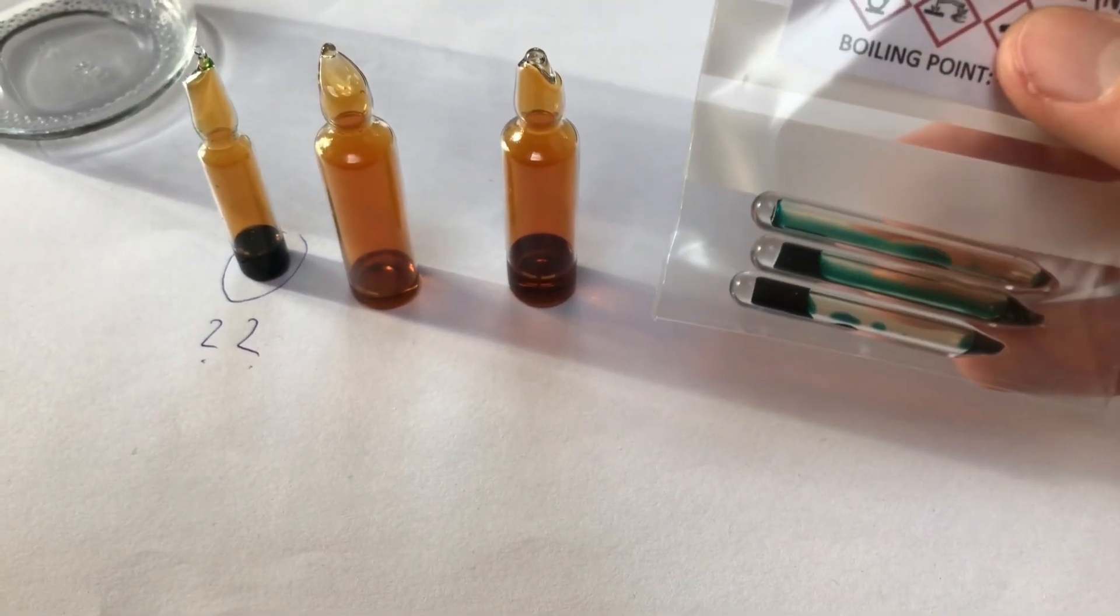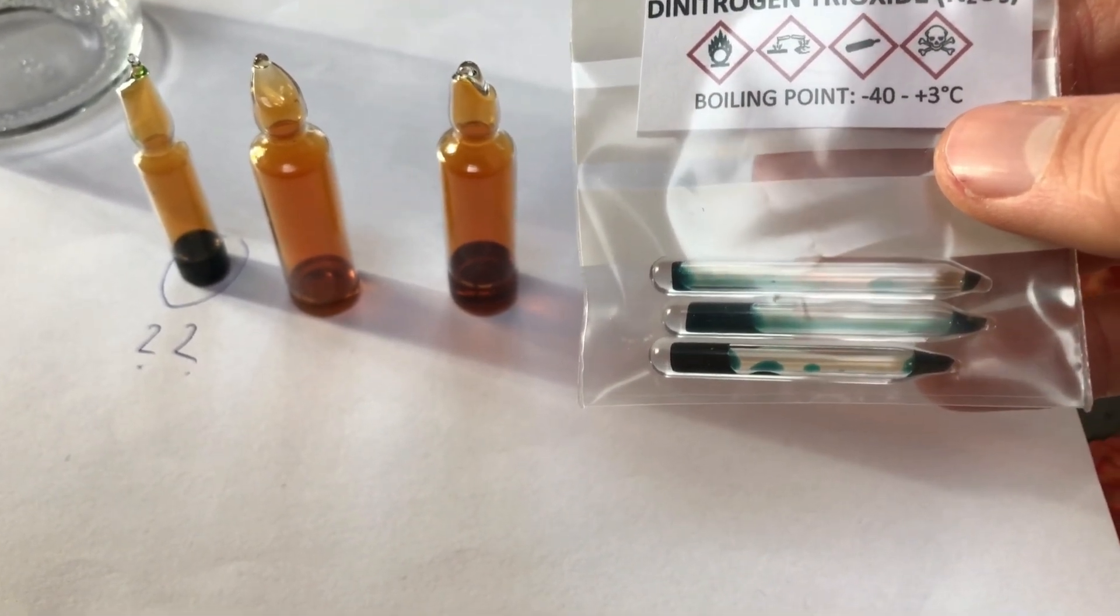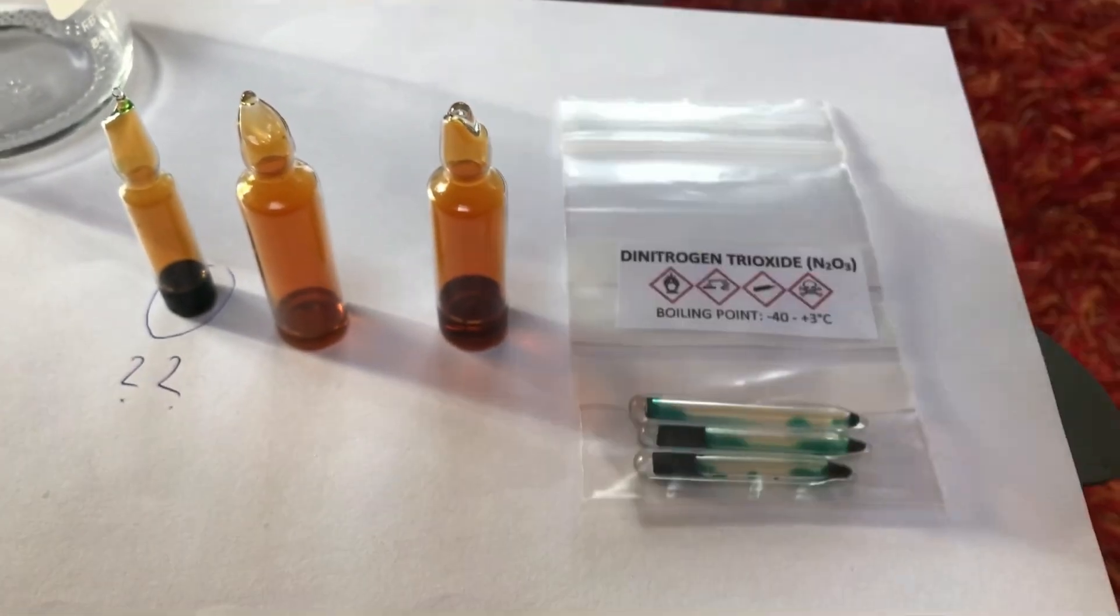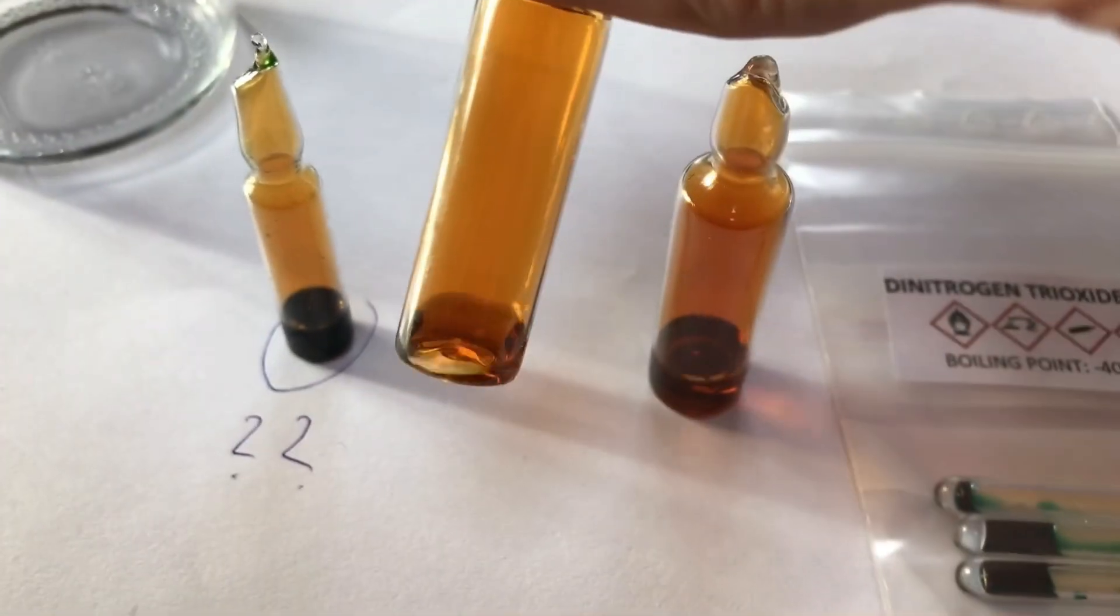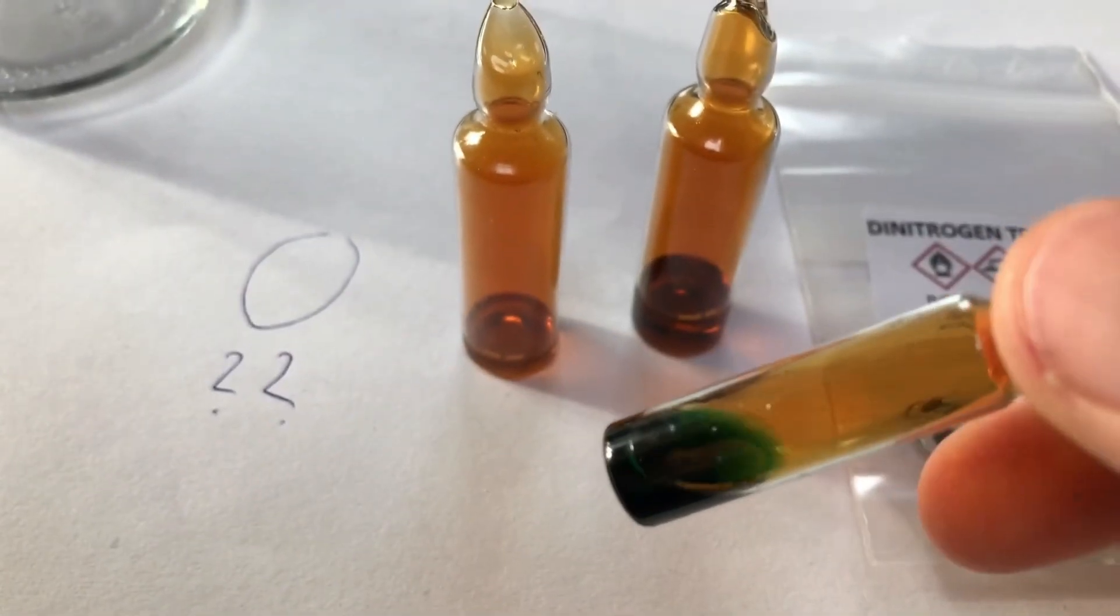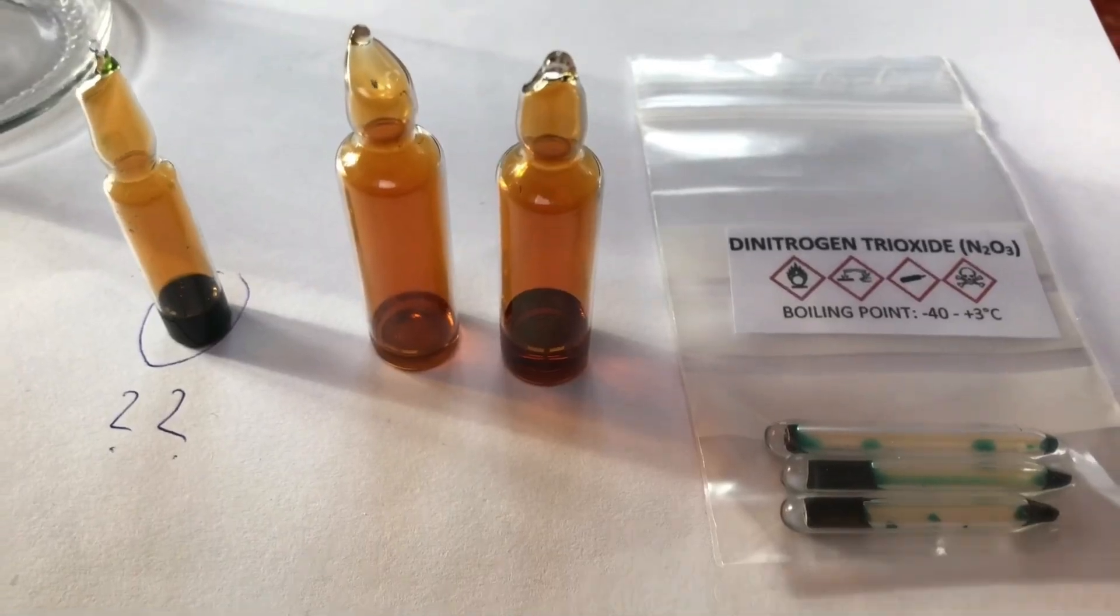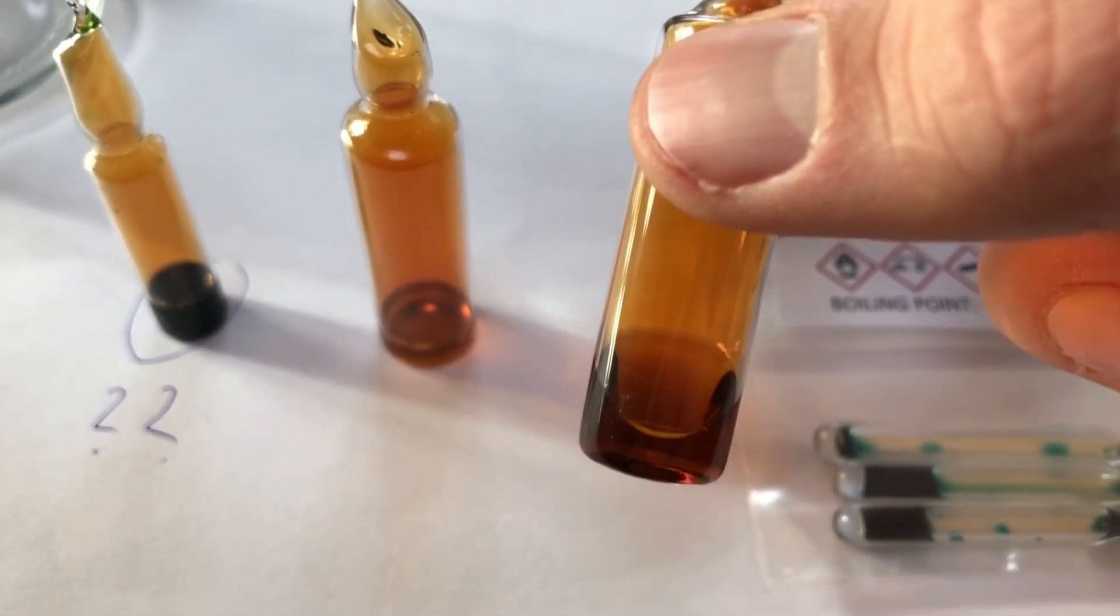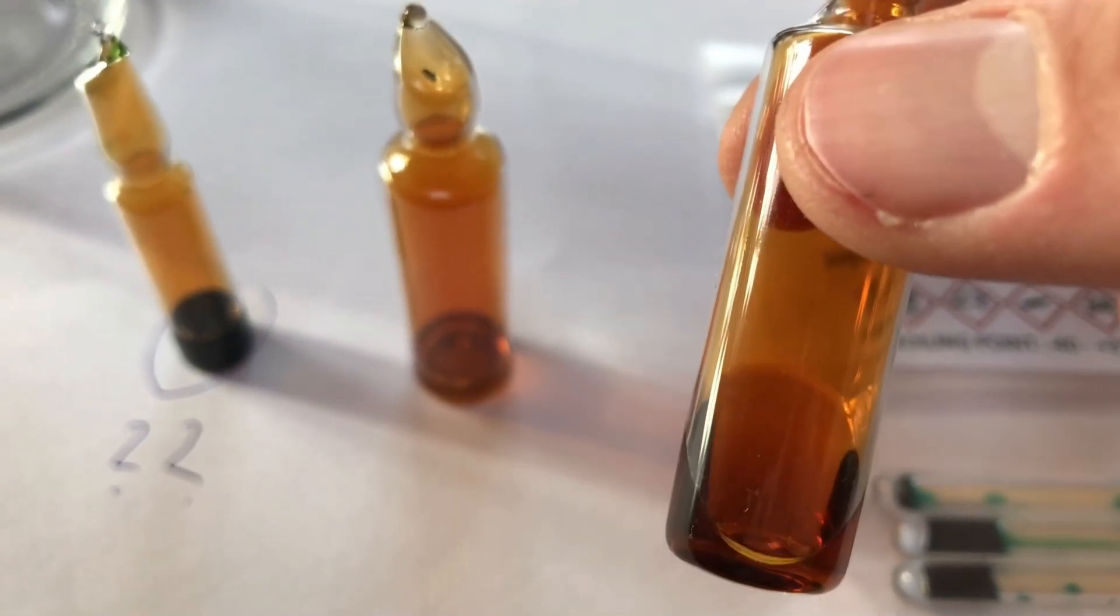This should be approximately 1g of pure anhydrous dinitrogen trioxide, which should not be contaminated with any nitrogen dioxide due to argon purging of the apparatus. We also got 2 ampoules of nitrogen dioxide and 1 ampoule of mixed nitrogen dioxide and nitrogen trioxide. Off screen I've also got an ampoule containing approximately 3 more milliliters of nitrogen dioxide, but I sadly cannot show you that because it's sitting in epoxy and I have to wait for it to cure.